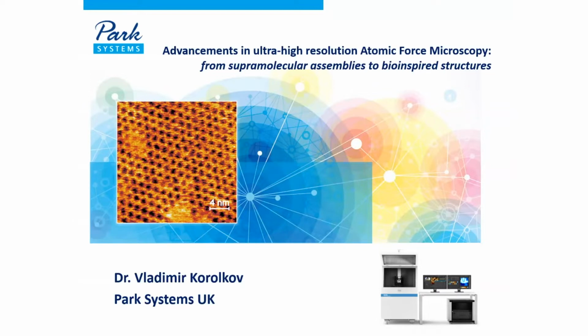As Simone probably mentioned in his previous talk, AFM has some very serious advantages in high resolution imaging. And the idea of achieving high resolution is actually very essential to different areas of science. In the previous talk, we saw that being applied in biology and biochemistry, but that also happens in all sorts of other scientific areas. For instance, I'd like to give you a quite different view on things.